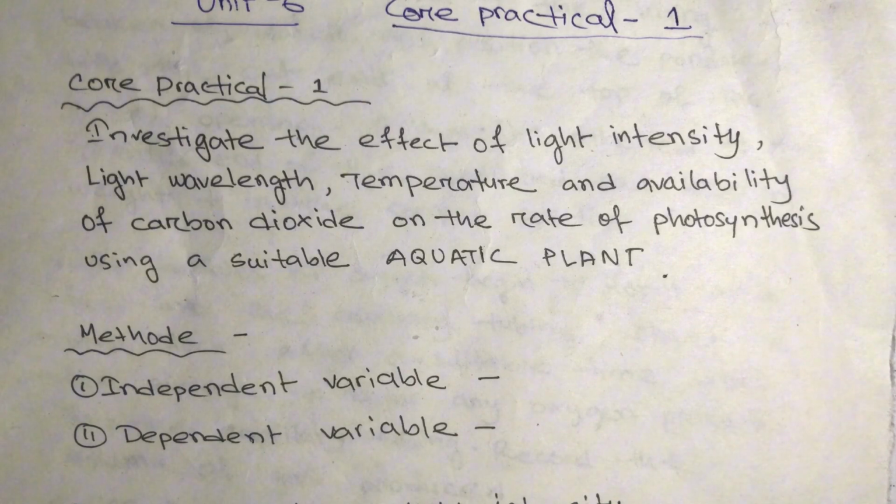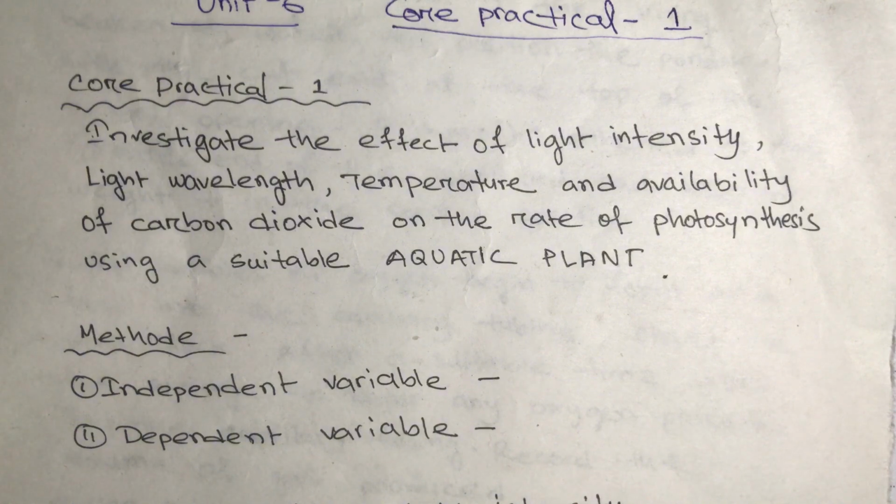Okay, then we will cover one side of the beaker with aluminum foil so that light can only enter from the one side, to control the variable or make the experiment more reliable. And to do this, like in Unit-6 experiment, you need to write the experiment in complete detail to gain a complete mark.